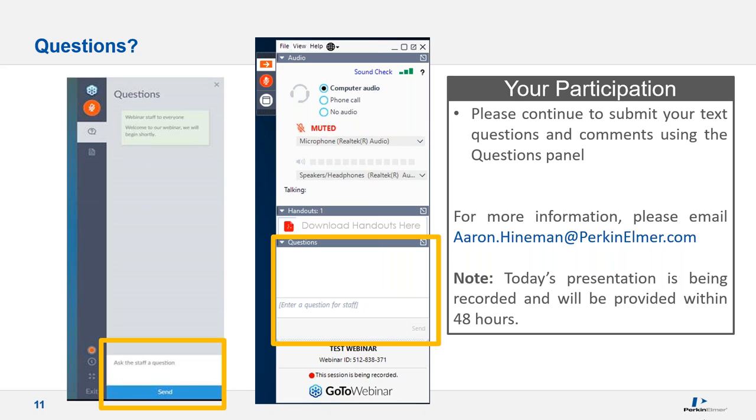When I did the brine work, at the end of each day I would take the torch out and soak it just to clean it, to try to prevent buildup over time and extend the torch lifetime. That's another option which works. Mm-hmm. Makes sense.